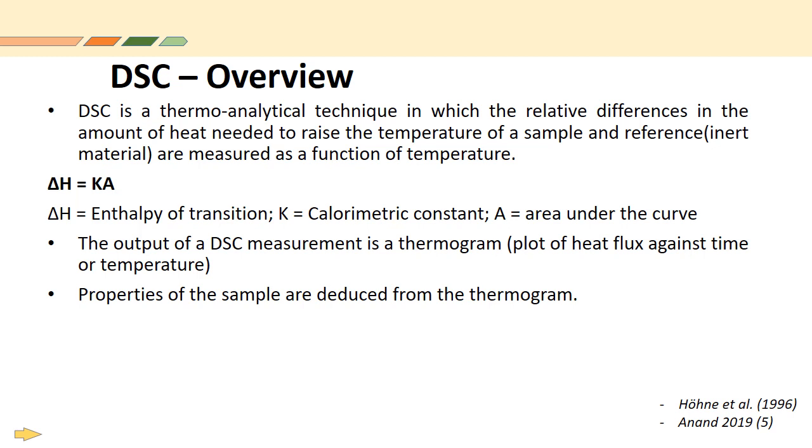Now this curve is a result of what we get from the output of a DSC. The output of a DSC always produces a thermogram, a plot of heat flux against either time or temperature. So the area under the curve multiplied by this constant gives us the enthalpy.